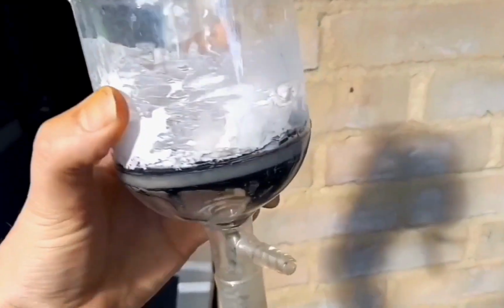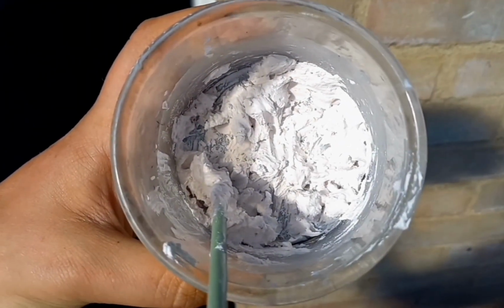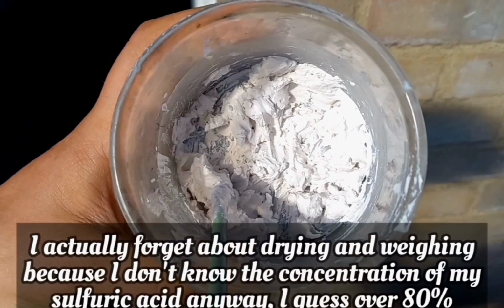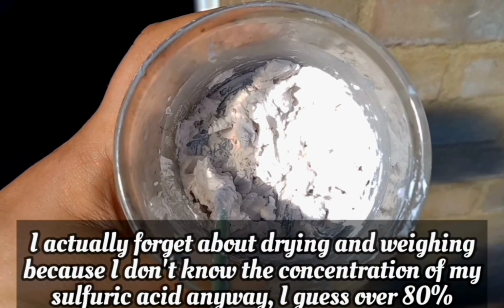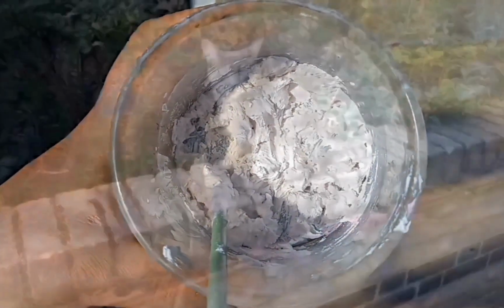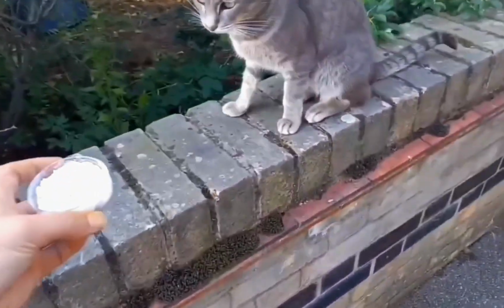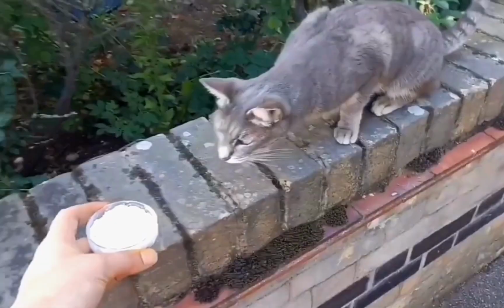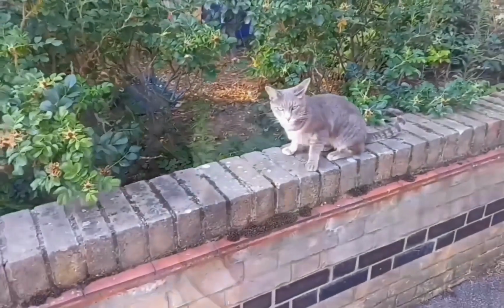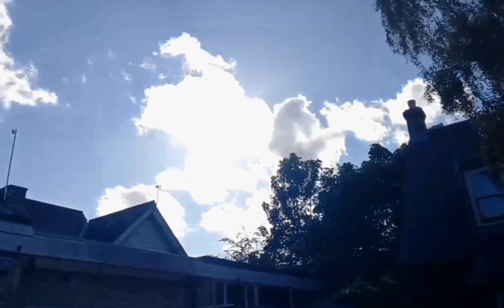I'll just leave it in the sun to dry out a bit. Look, barium selenate. Trying to get this in the sun, but the sun's disappeared behind that cloud.